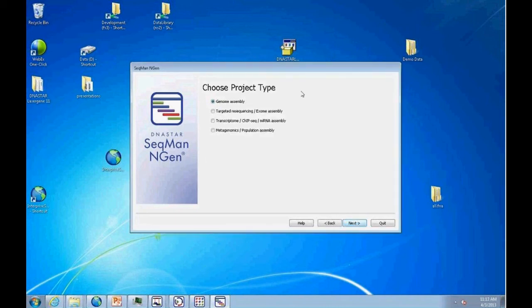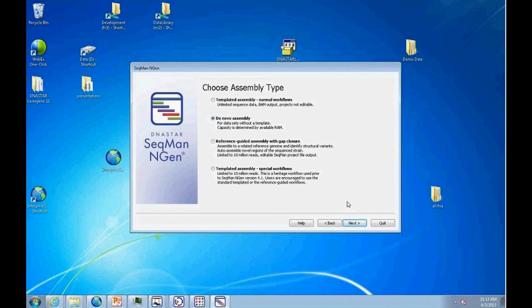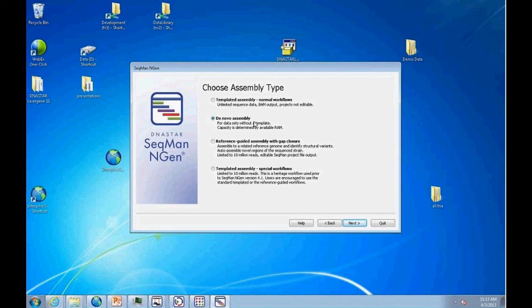Next, we set up sequence files and define the read technology using a pull-down selector. We distinguish between unpaired and paired reads. For paired reads, you specify the insert size — this dataset has one set of mate pairs at 9,000 bp and another at 3,500 bp. Most Ion Torrent customers have single-end data, but mate pair data has advantages: if your goal is to fully close the genome, our software can use mate pair information to automatically order contigs, saving significant manual effort.